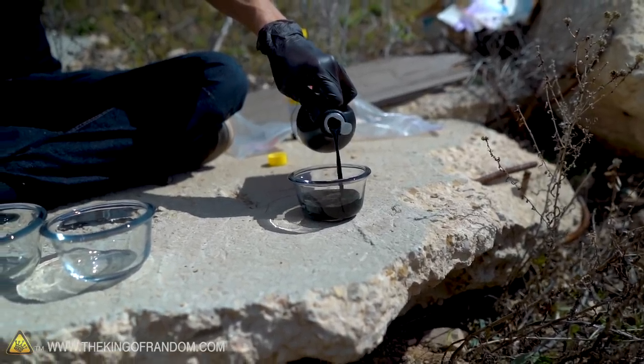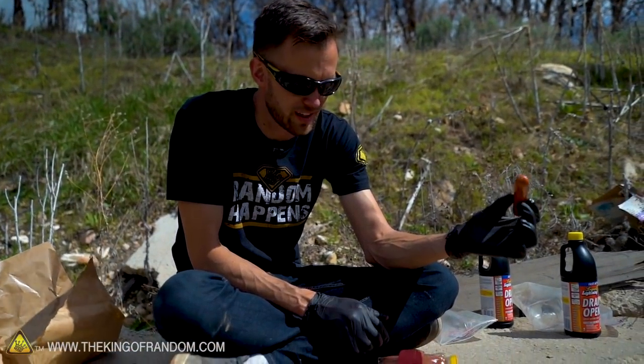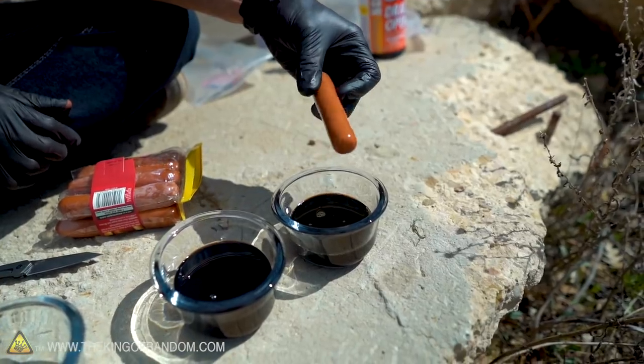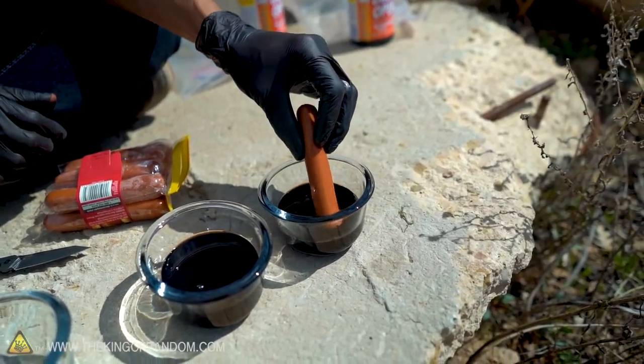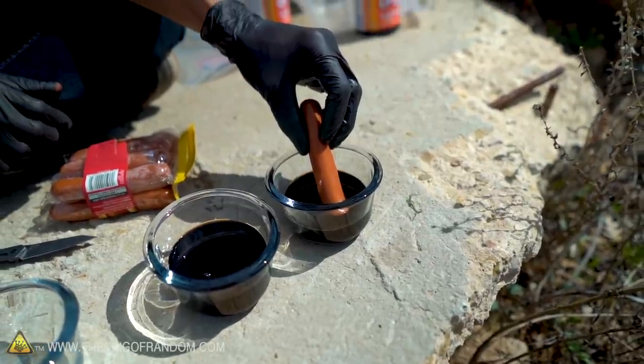We've got ourselves a hot dog — that's made of some kind of meat, a little bit of a mystery. First off we're just going to see what the acid does to it. I'm going to dip it in for like five seconds, pull it out, see if anything's changed, and then if it hasn't completely eaten through it, we're going to let it sit in there for a while.